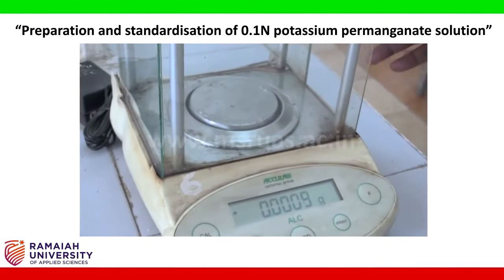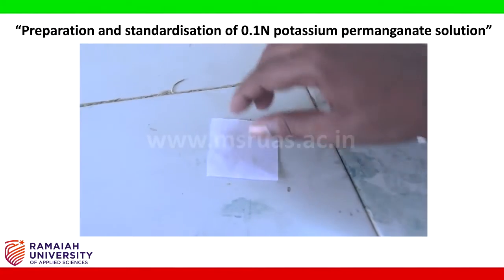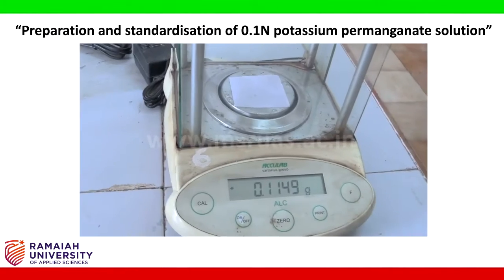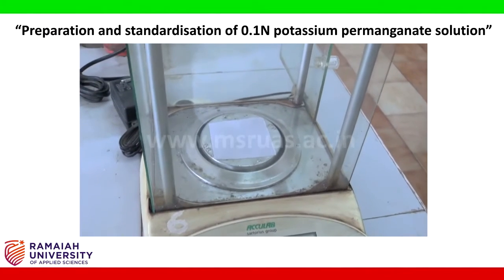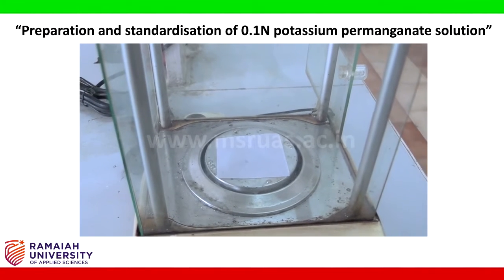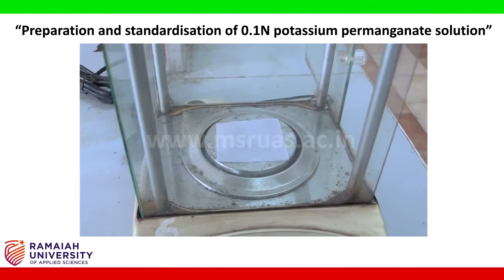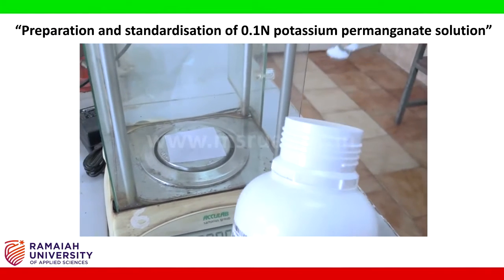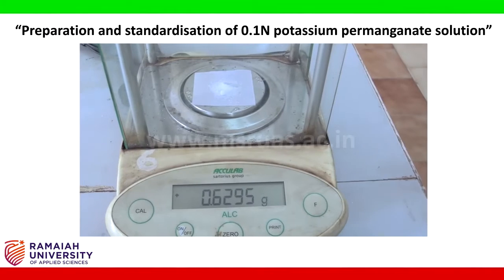First, switch on the weighing balance, mark as 0, then by using the butter paper we are going to weigh. After placing the butter paper, we have to make it auto zero, that is tare. Once it becomes 0.00, we are going to weigh the purified oxalic acid. Amount to be weighed is 0.63 gram. Weigh approximately 0.63 gram.